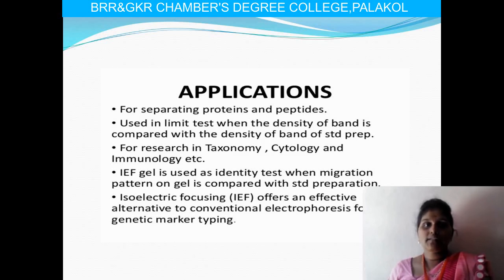Because of its convenience and speed, polyacrylamide gel plates and isoelectric focusing are most commonly used in clinical and forensic sciences and also in human genetic laboratories for serum proteins. This method is also used in the food and agricultural industries. In the agricultural industries we use it for the separation of different molecules.